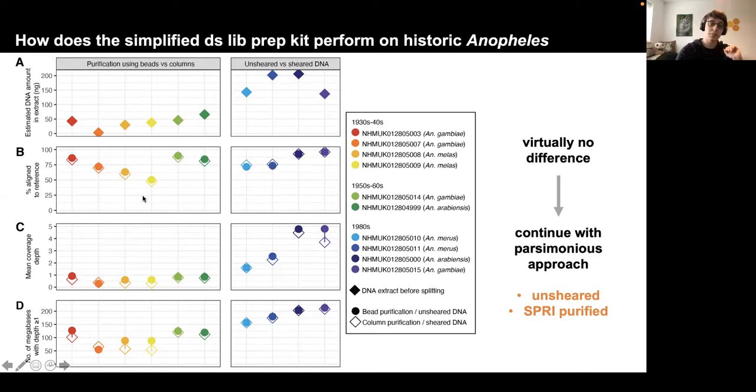Even samples that here would be considered bad still have 50% aligning to the reference. And these are actually samples that are most distant evolutionary to the reference. So this difference might very well not be microbial contamination, but this is a bad reference for this species.